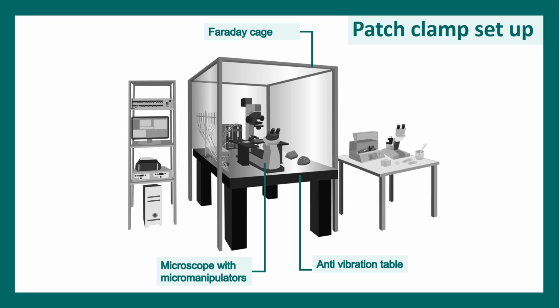Now it is mounted on an anti-vibration table, because while finding or patching a neuron, minute vibration matters. And all of this setup is connected with an amplifier setup, because first of all your signals are so low, you first need to amplify the signal in order to visualize something in the computer, and it is attached to a software which is controlling these amplifiers and other electronic components.